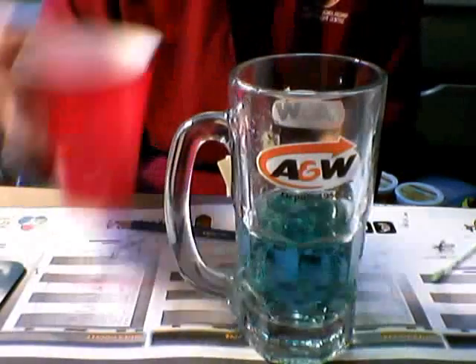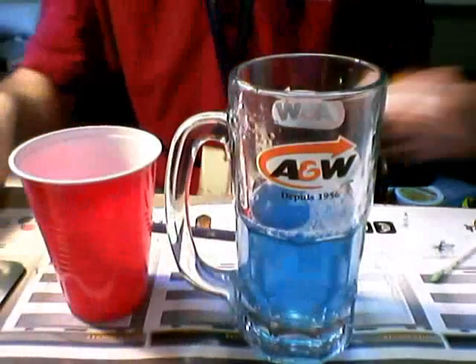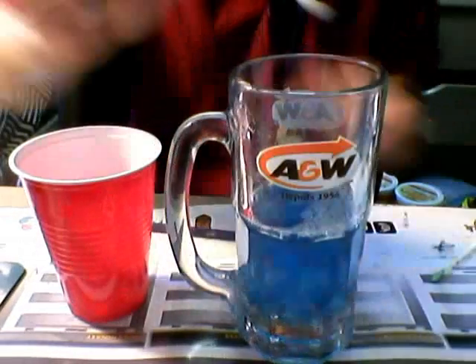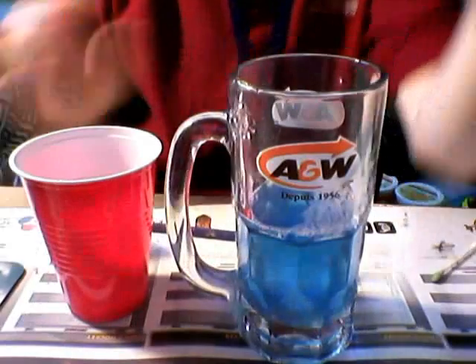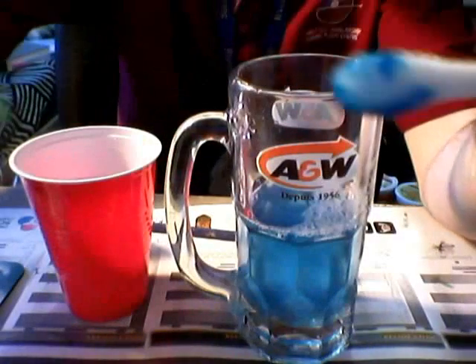I'm going to pull in the dish so you can see it turn more blue. Did you see a darker blue change there? I'm going to dunk in a Q-tip. I'm going to add a drop of Bromothymol Blue with a Q-tip. That's nice and blue, right? So I'll put the two up — this is the green one, and here's the blue one.